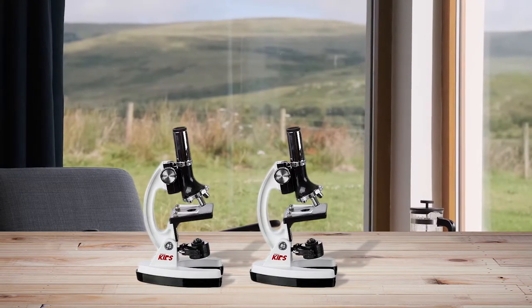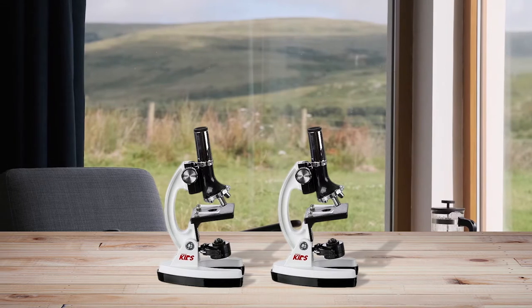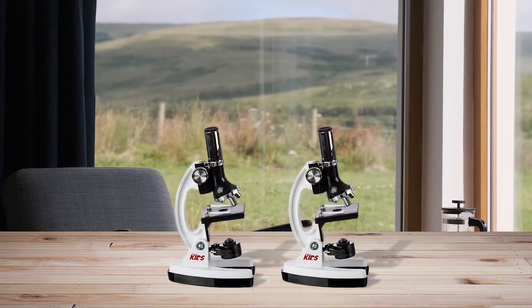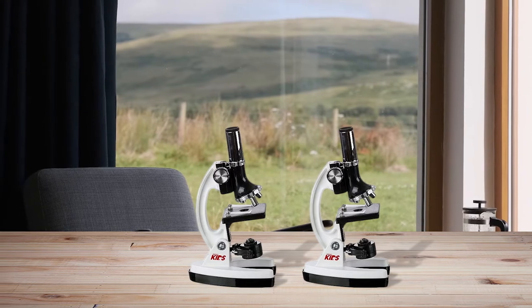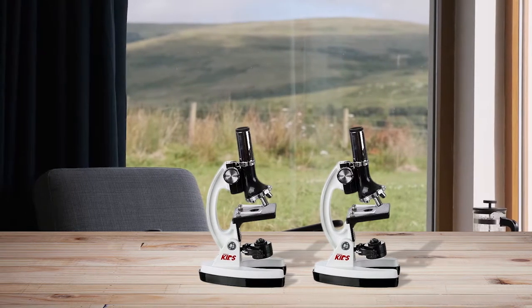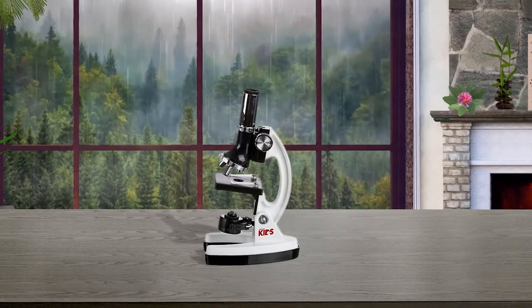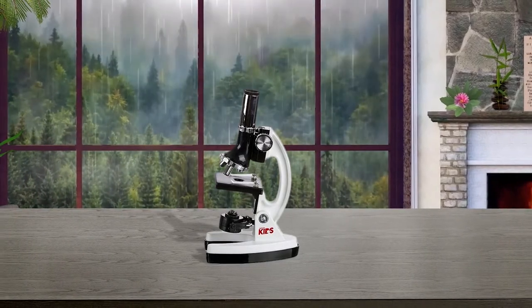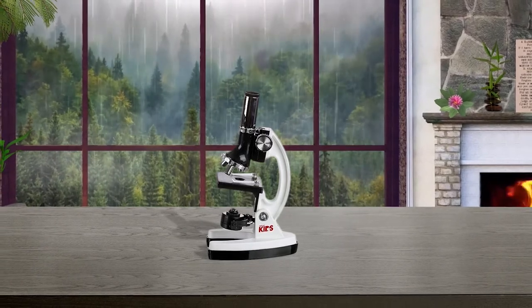Easy to use and portable, the package includes tweezers, 5 prepared slides and 7 blank slides, petri dish, cover glasses, needle, eyepiece, and more — a total of 52 accessories. Best for students who are interested in science and microscopy, this microscope provides versatile functions and comes with an affordable price for college students.